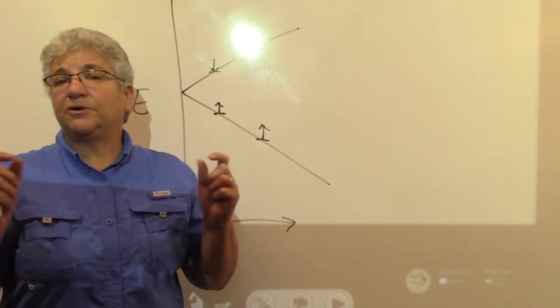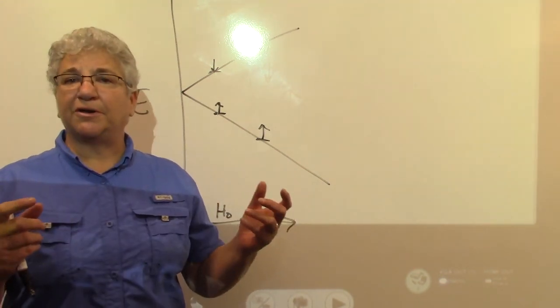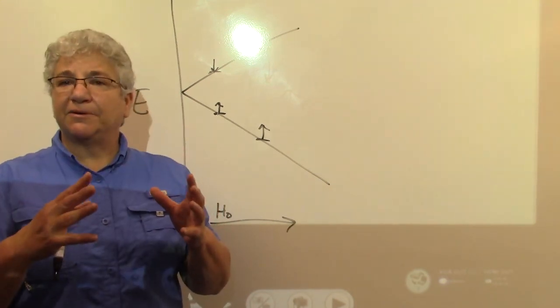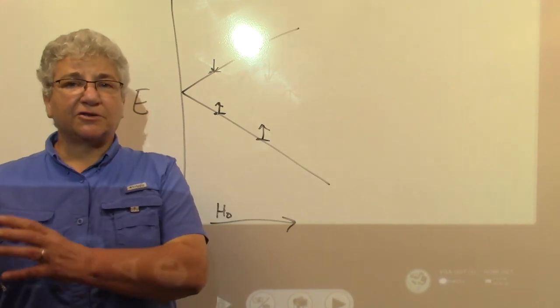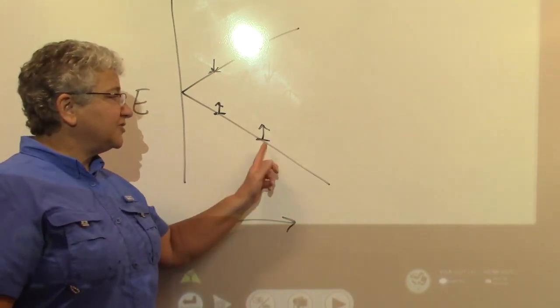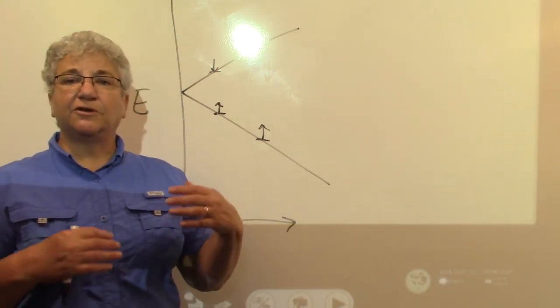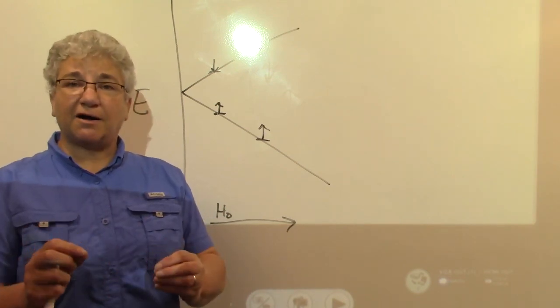Is it bound to another carbon? Is it bound to an oxygen? Is it double bound to a carbon? What is its molecular makeup? That changes for each atom in your molecule if those atoms are different, and so that's going to change the energy gap between with the field and against the field for each one of your atoms. That's what's crucial.